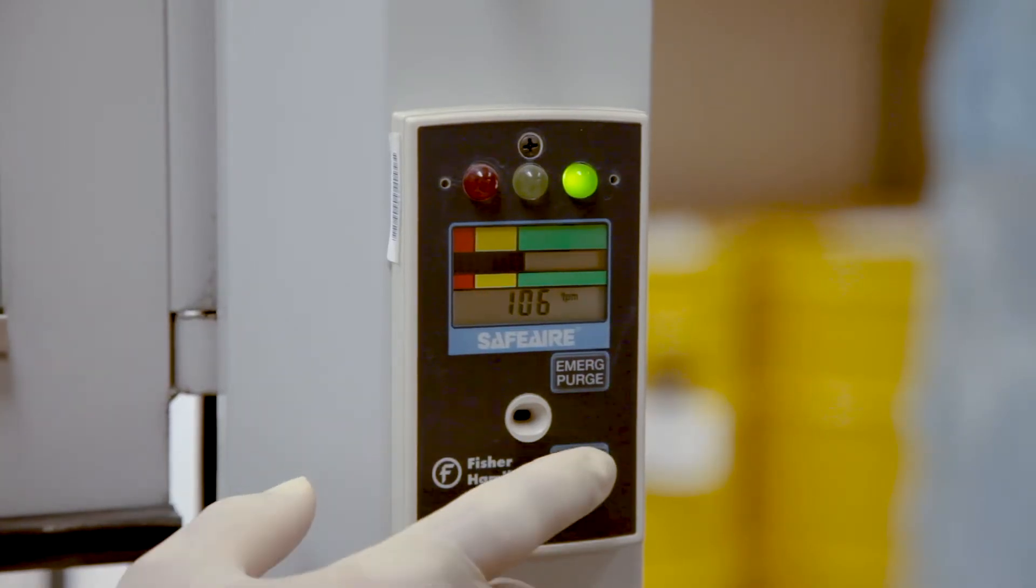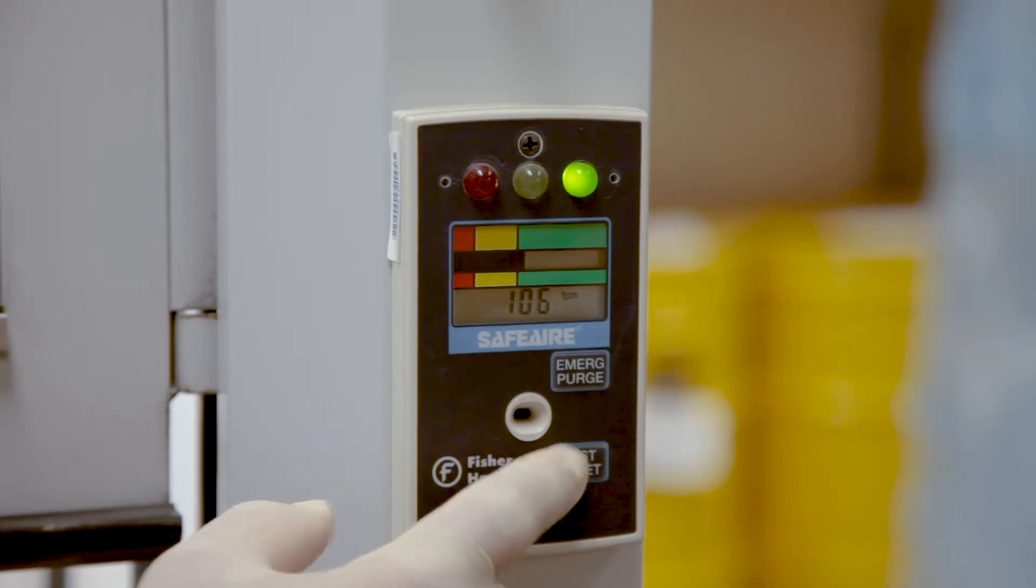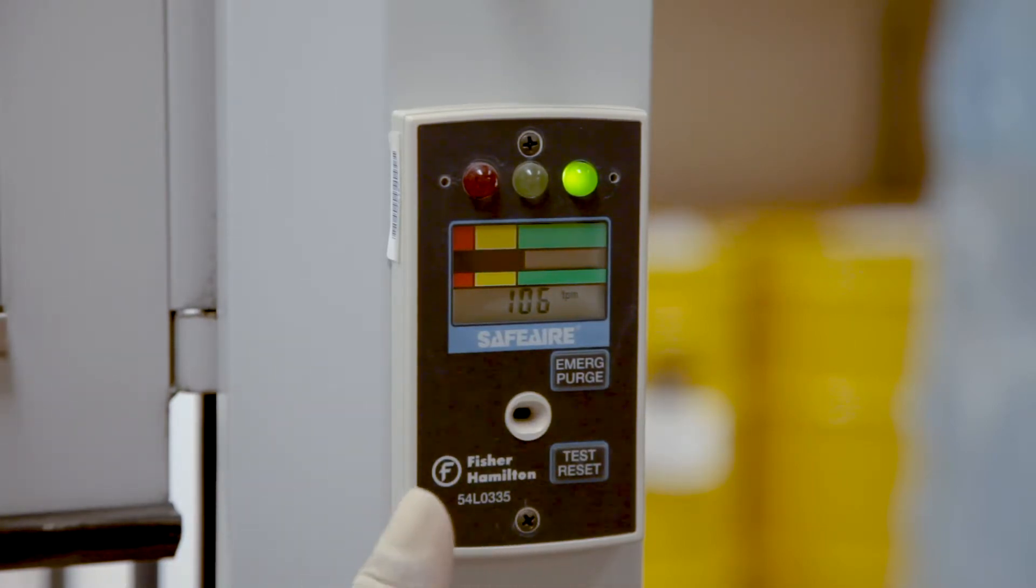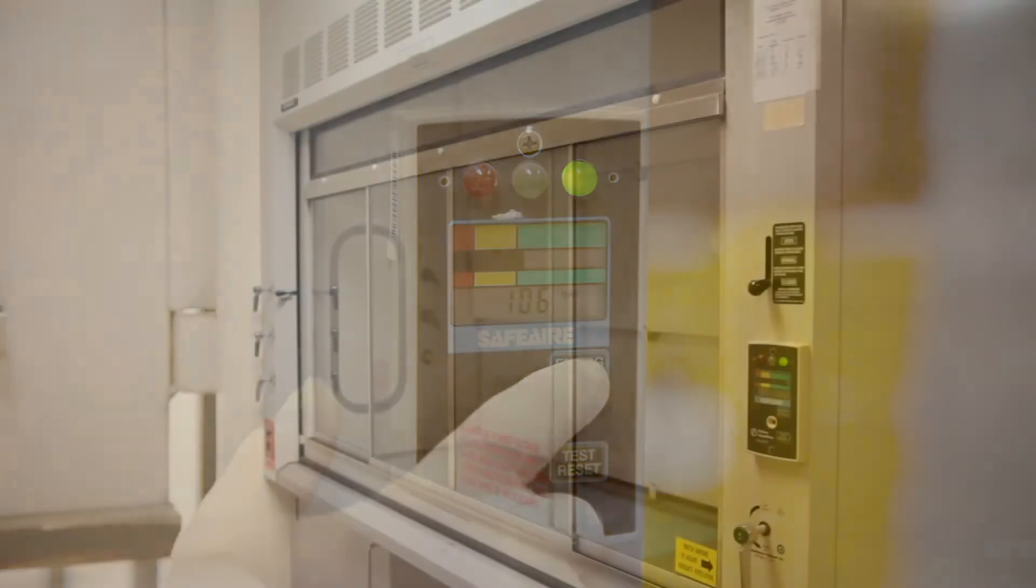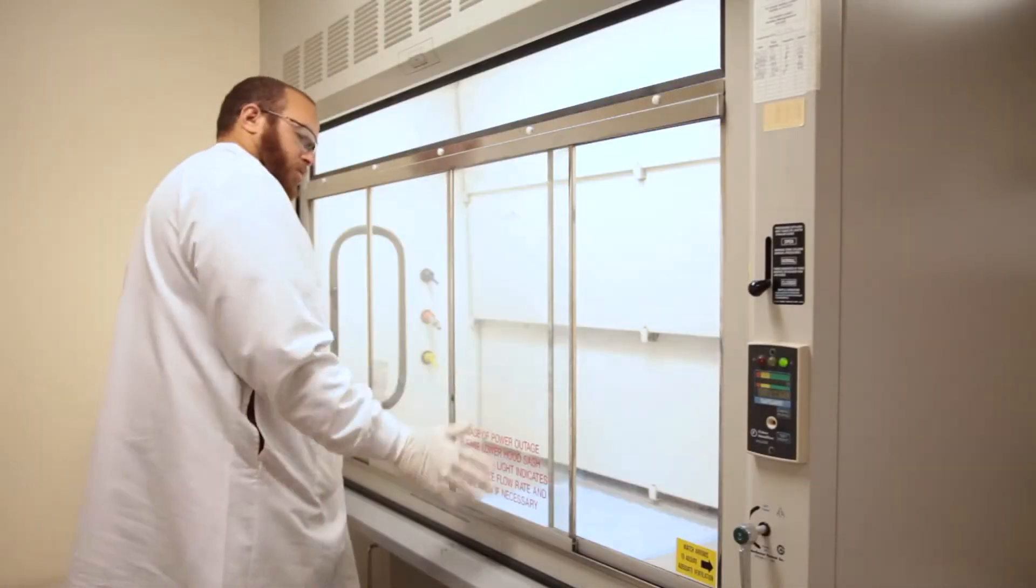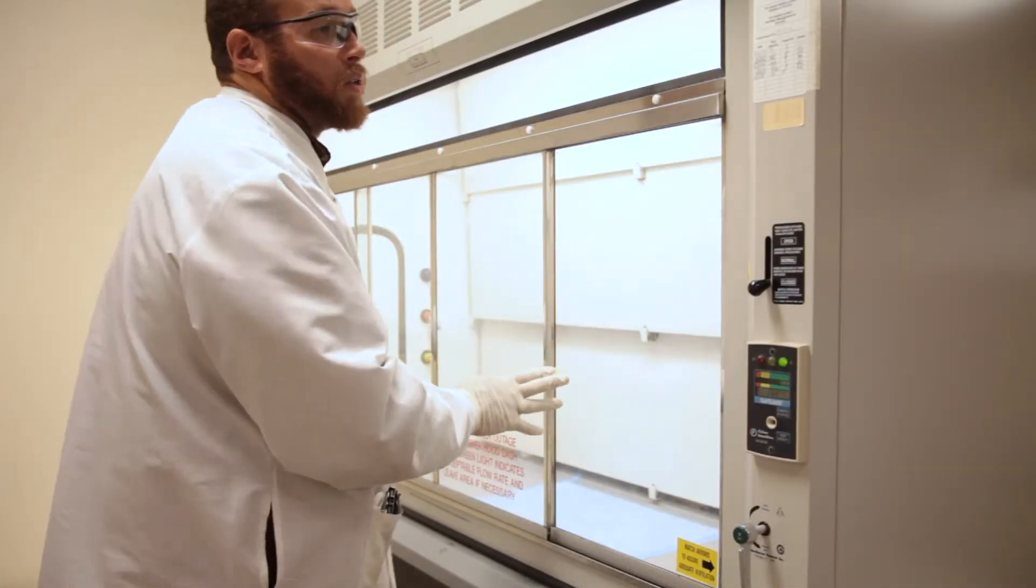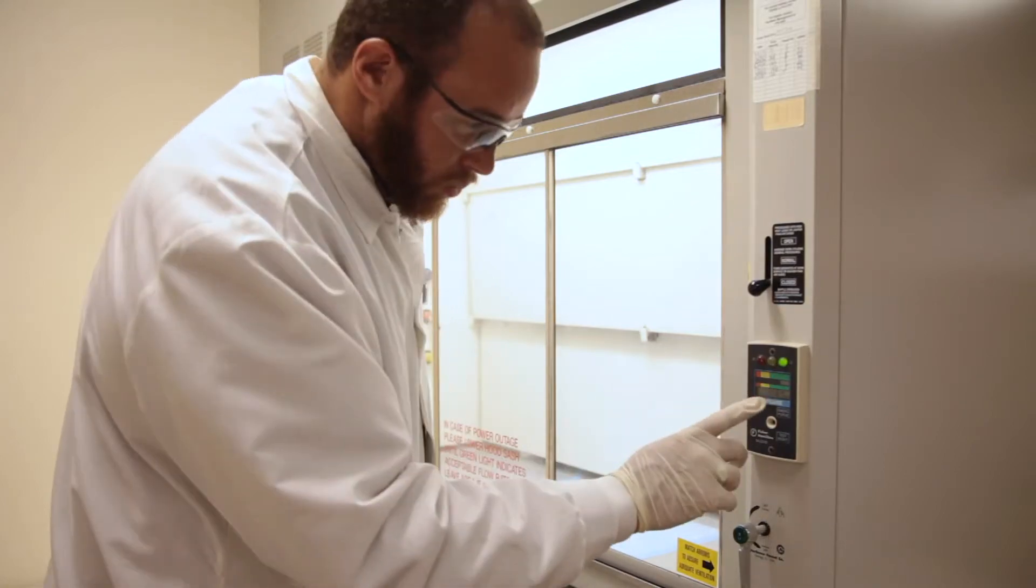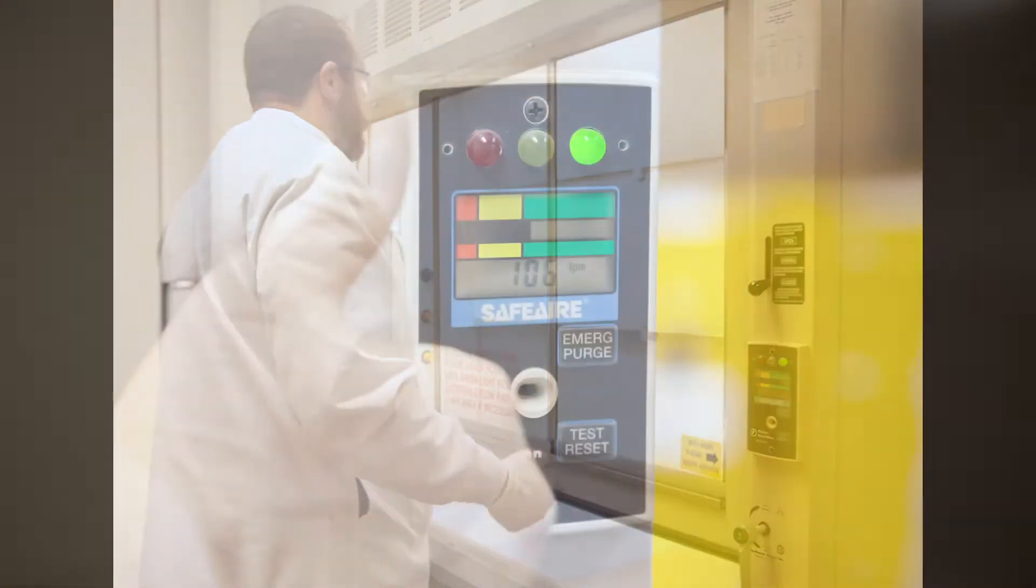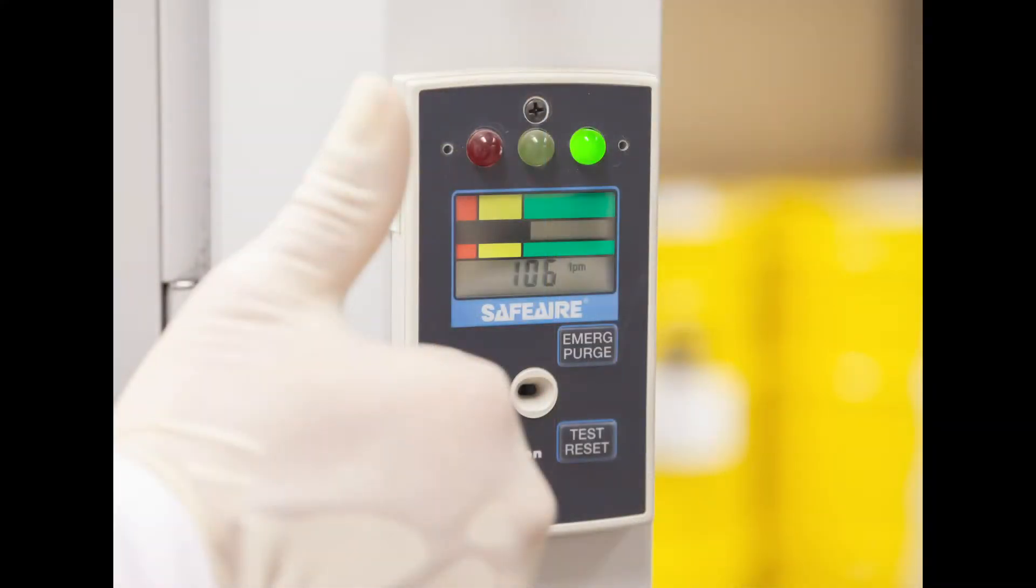The digital airflow display monitor shows the face velocity of the fume hood. This type of device commonly has an audio and visual alarm. Always verify proper function of the hood before use by checking the fume hood monitor or alarm before beginning your work. Your fume hood should be operating with a face velocity of 100 feet per minute or greater.